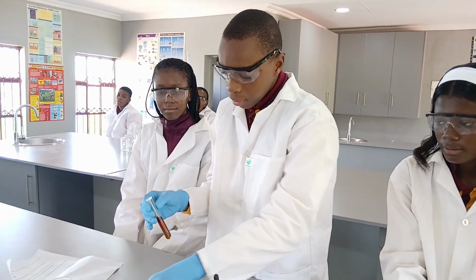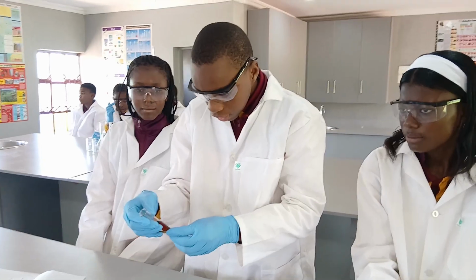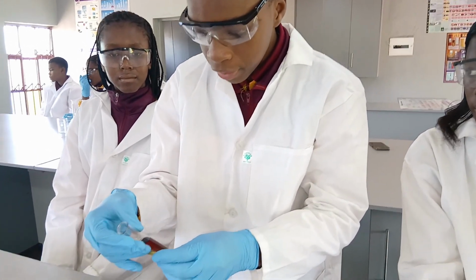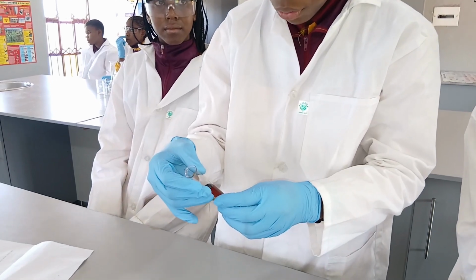Now we'll grab our pH scale and check. The color of this is a dark orange, meaning that it has a pH value of 2 or 3.